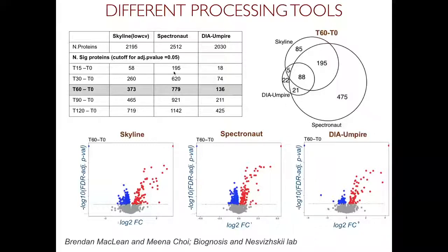And so, again, which one is better? Spectronaut kind of looks somewhat suspicious, right, with that many features, even though the increase is monotonic. It's just numbers, and again, I'm no biologist, maybe it's true, but to me it looks like this is probably too much. I think here it's clearly differences due to the property of the instrument. To me, this is probably the right middle ground here.